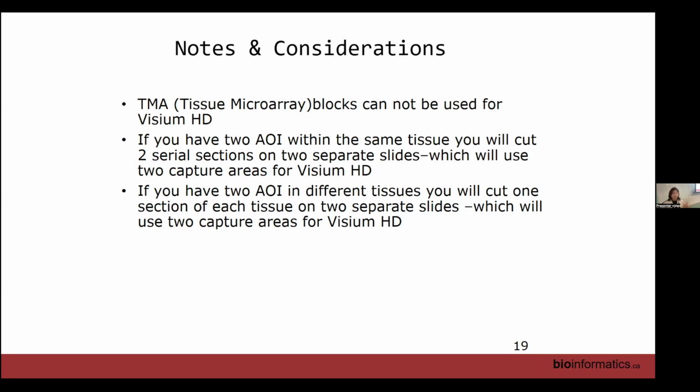And on top of that, of course, your tissues. You don't know what's in the TMA block. So if there's a possibility of it lifting, yeah, you're going to lose your data. So that's another issue that you're going to face.